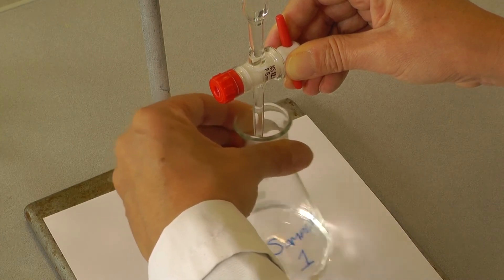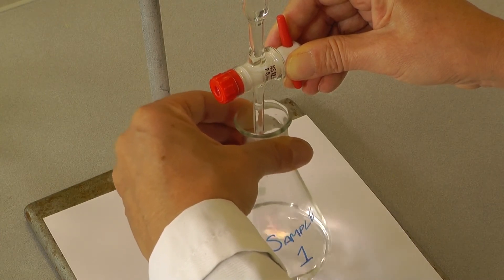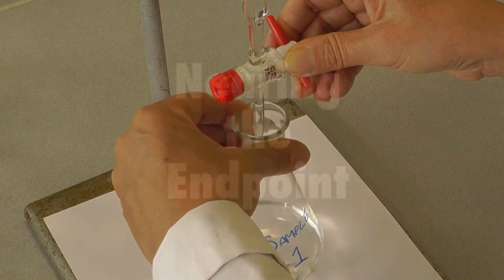As soon as you notice any difference in colour, either a colour fading or a colour change, close the tap and swirl vigorously.